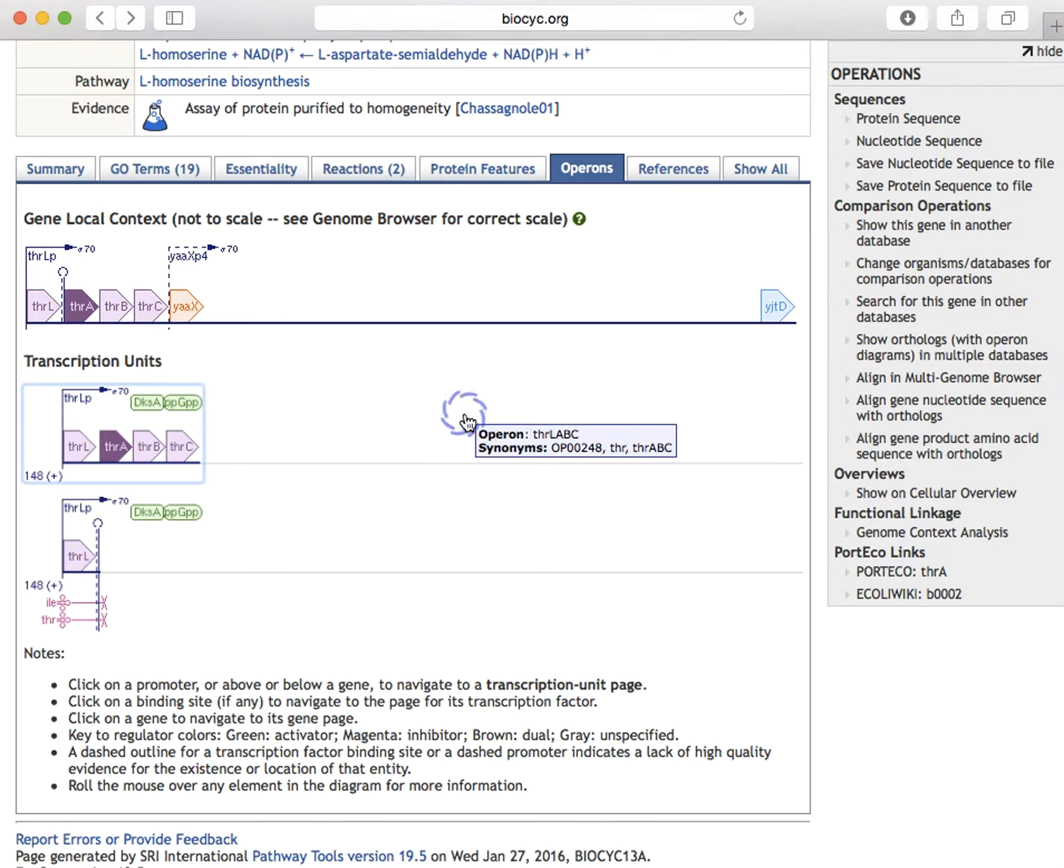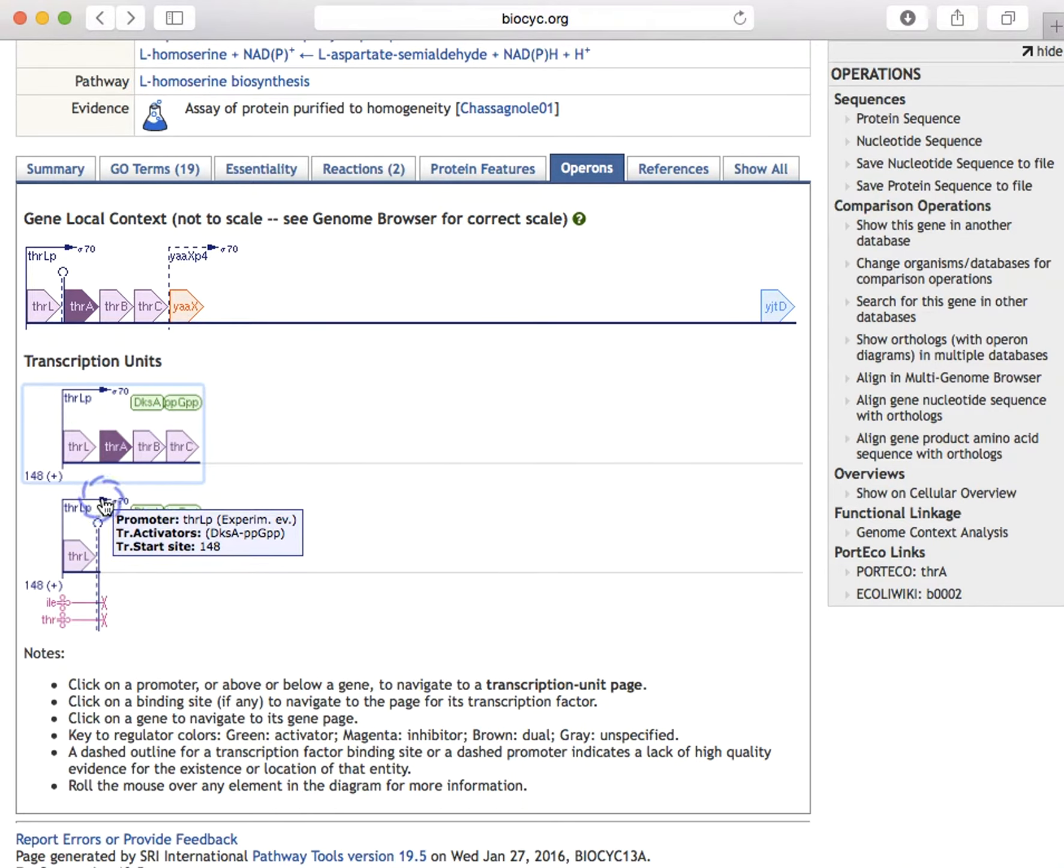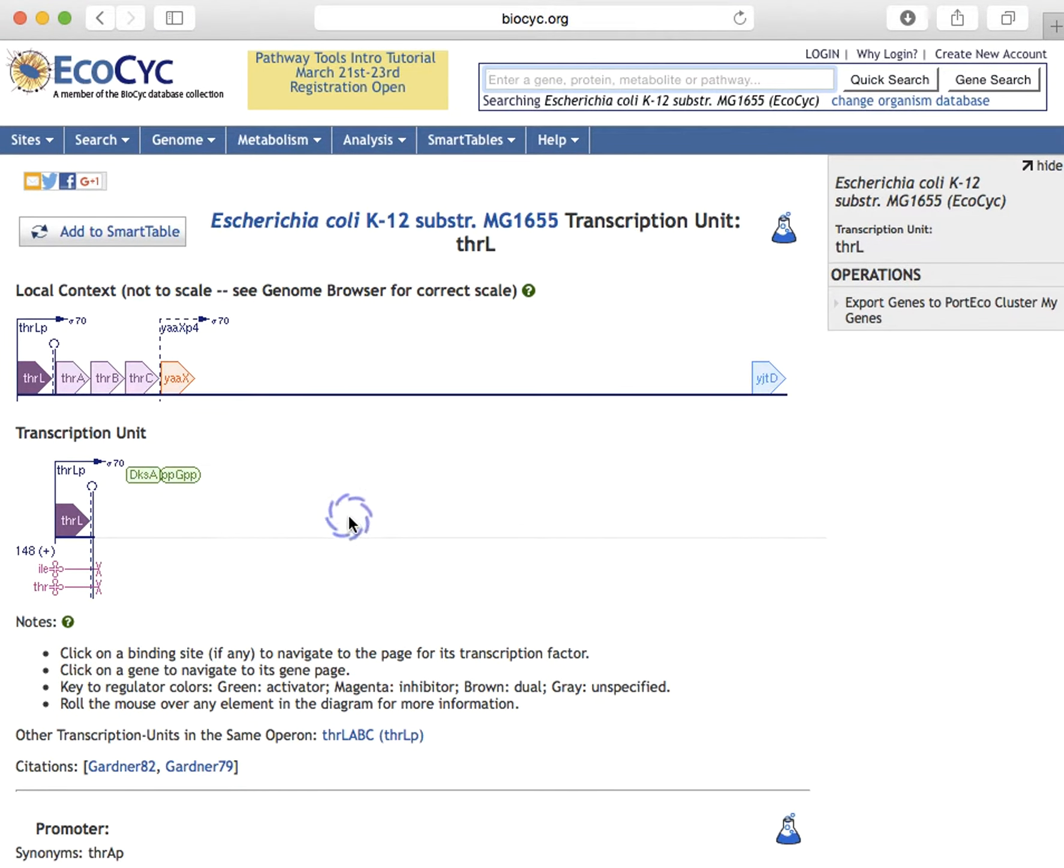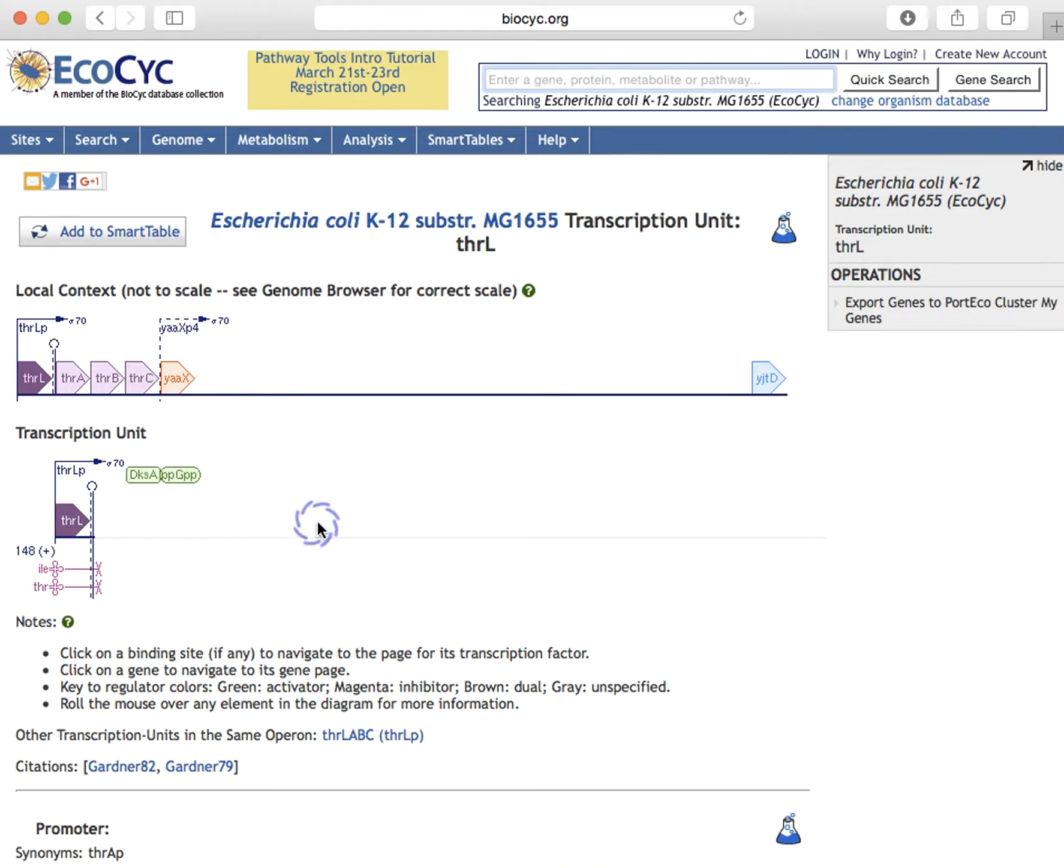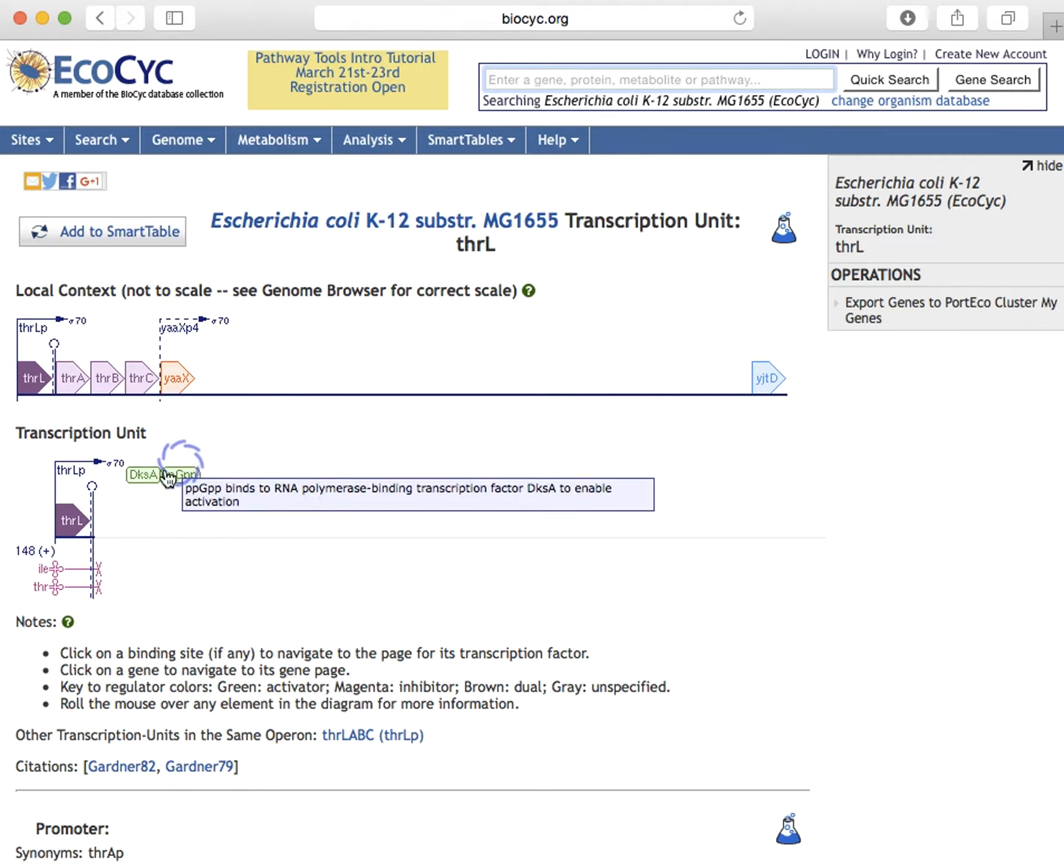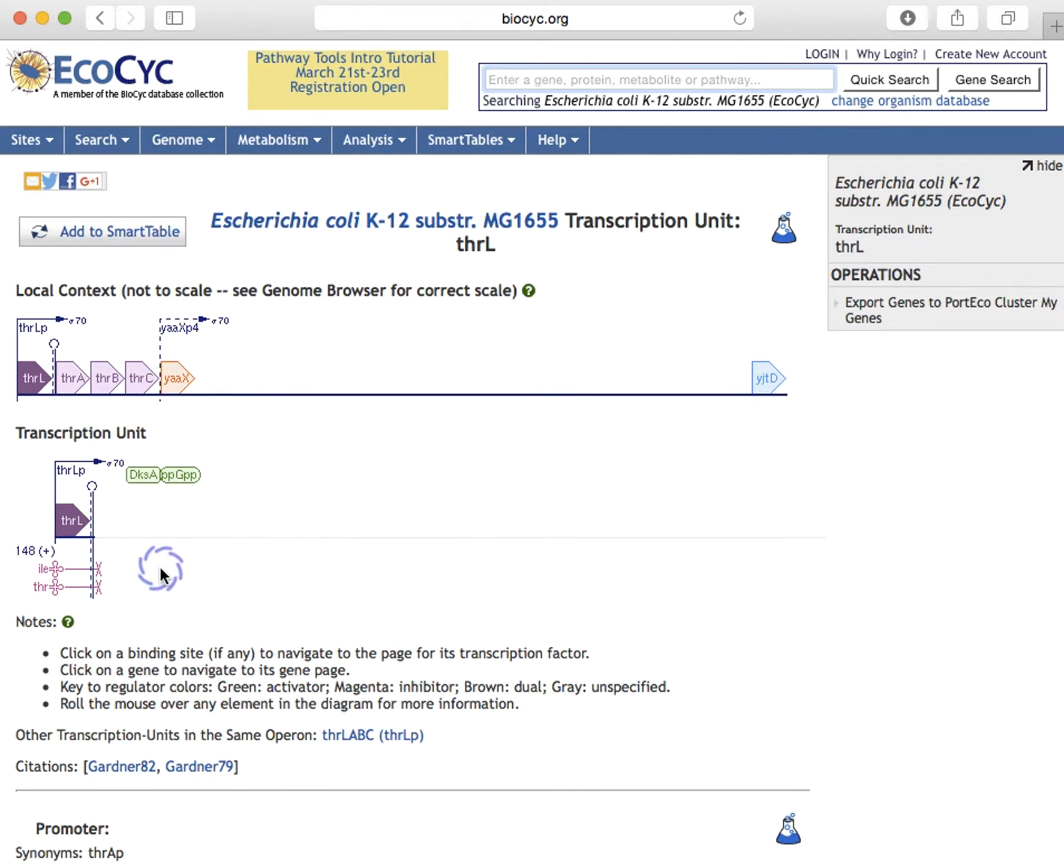Let us now examine transcription unit pages. If we click on a promoter in this page, we will go to a transcription unit page for the THRL transcription unit, which regulates genes involved in threonine biosynthesis. The flask at the upper right is the evidence for the existence of this transcription unit. We see its transcription start site, and we see the sigma factor that regulates this promoter. We also see an attenuator that is sensitive to two different charged tRNAs.